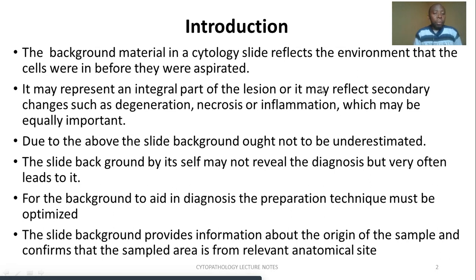For example, if we are applying the aspirates on the slide, we need to not apply a lot of force when making smears on the slide, because we may end up rupturing these cells, and in the background we may think there was some necrosis, when actually it was a wrong technique of making slides, where we ruptured the cells and they appear smudged and necrotic, or mucinous in that case.